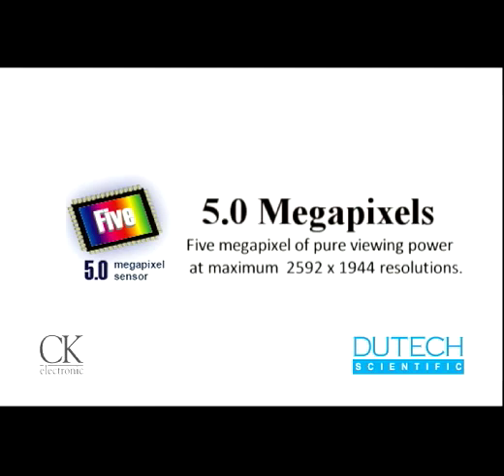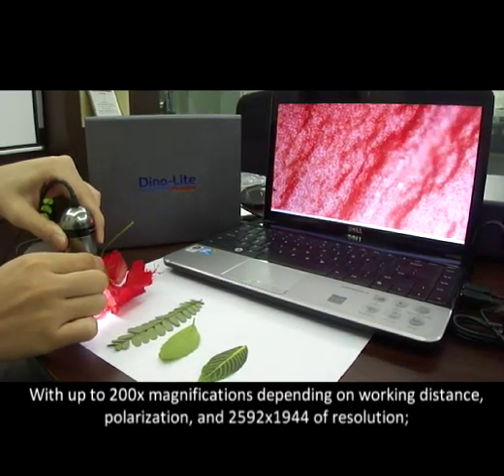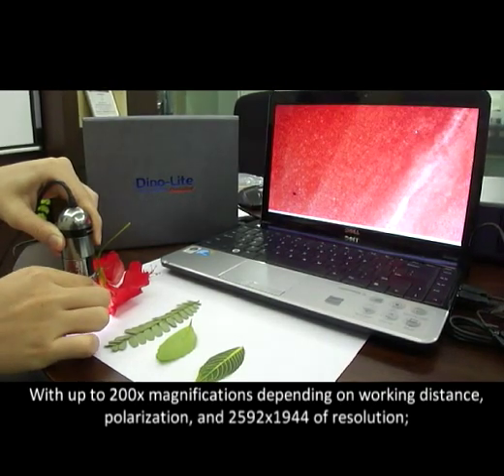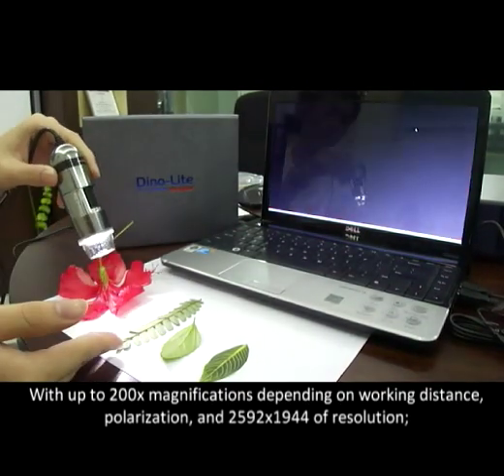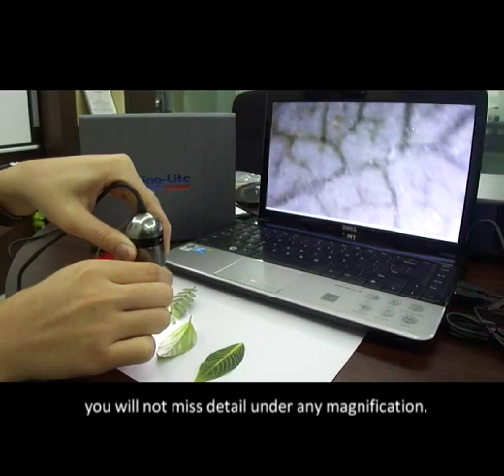5 megapixels of pure viewing power, with up to 200x magnification depending on working distance, polarization, and a resolution of 2592x1944. You will not miss any detail under any magnification.